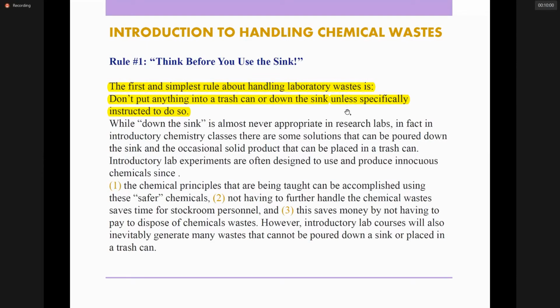But this sink has an appropriate way to use it. Not all solutions can be poured in this water sink, unless you are specifically instructed to do so and it is safe to dispose of in this water sink.